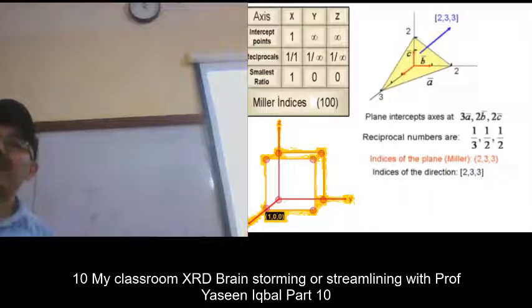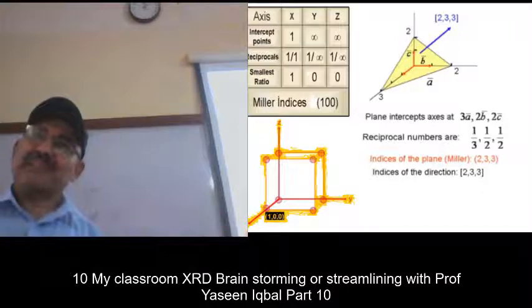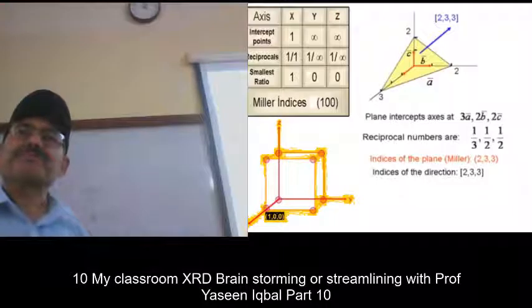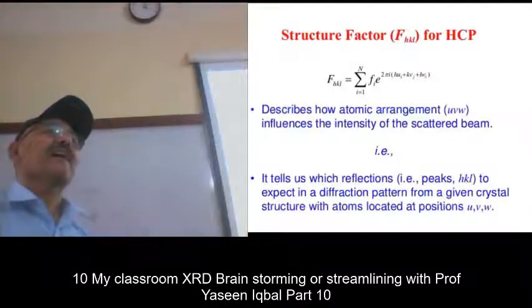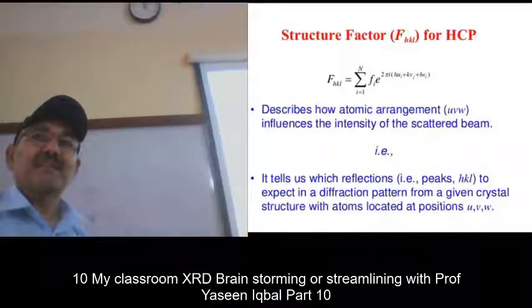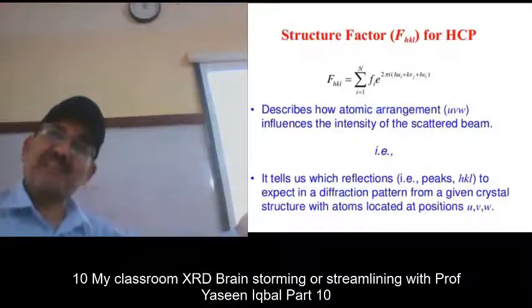Each and every atom behaves like a scattering center for the incident beam, and it scatters. Right? Now, we are saying that the diffraction is telling us about the orientation of planes.